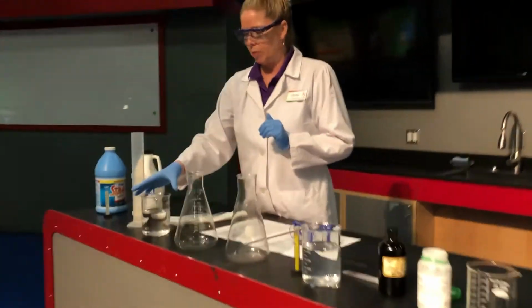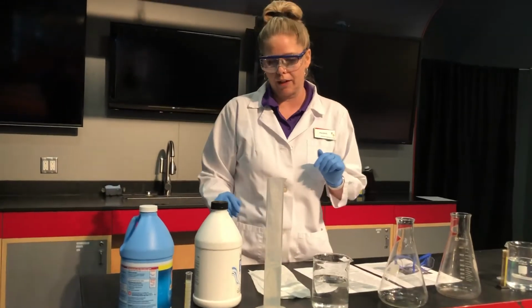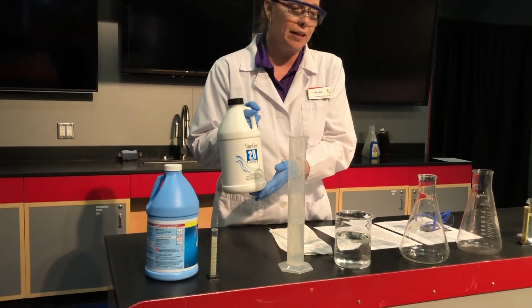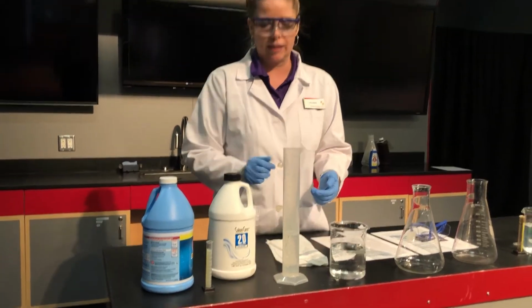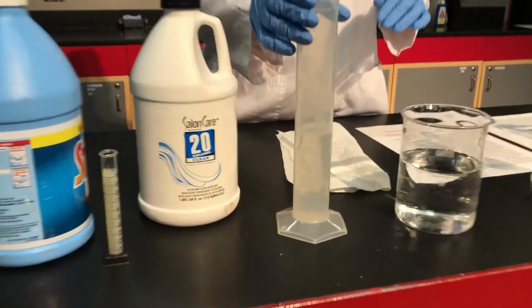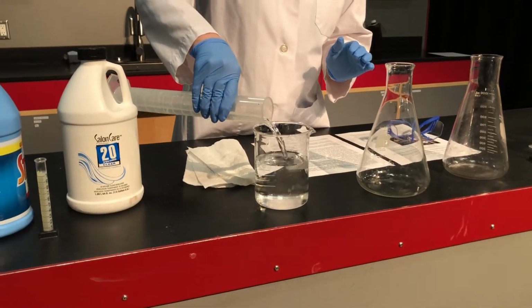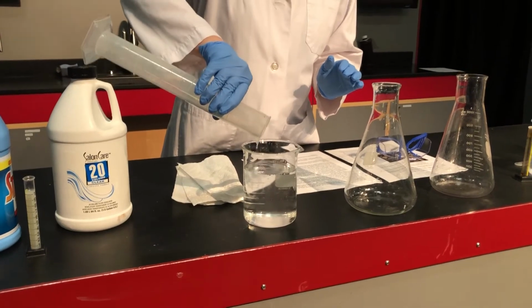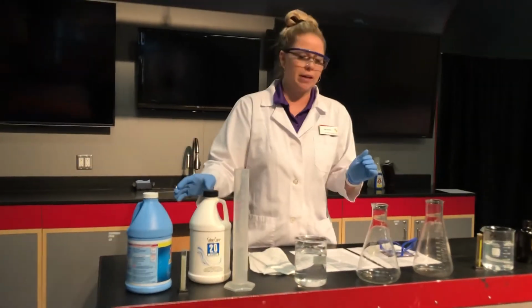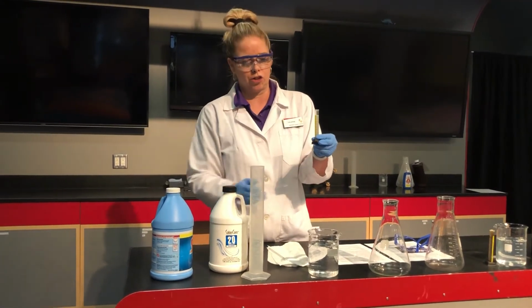On the other side of our table, we have another beaker of water here, same amount of water, but we're gonna add a couple other things to this one. We're going to start with some hydrogen peroxide. You might find this at the beauty salon or at home in your medicine cabinet. Hydrogen peroxide kind of foams up if you put it on a cut, you'll see, or you might use it to bleach things. So we're just gonna add this clear-ish solution to our water, and we don't see much of a change. All right, we're adding something clear to something clear, so probably not gonna see anything. But we also are going to add this starch to our solution.